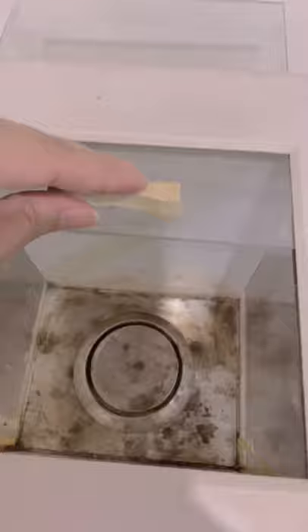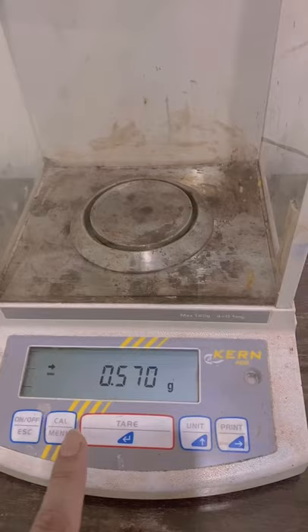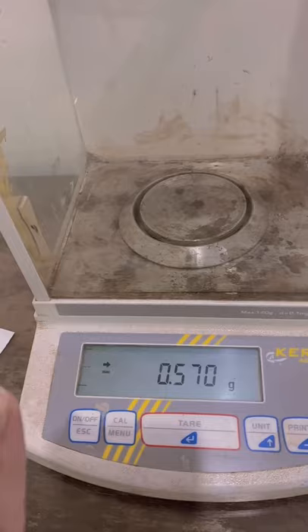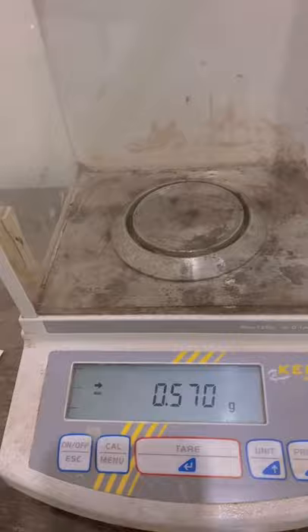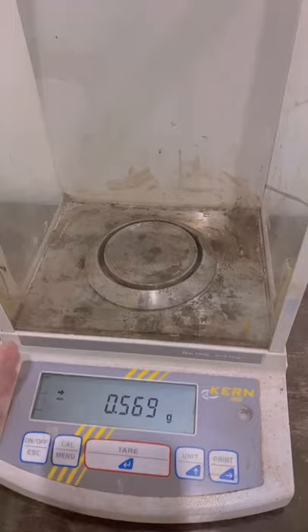It also has a drop loading window so that we can load it from there — we can put flasks or anything and weigh them. It has a right window and a left window. These windows are supposed to be closed when you are weighing the sample, because air currents passing through can disturb this very sensitive instrument. The glass doors are all supposed to be closed when samples are being weighed, as the glass coverage prevents the samples from being disturbed by dust, air currents, or vibrations.